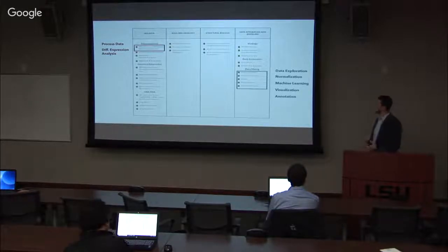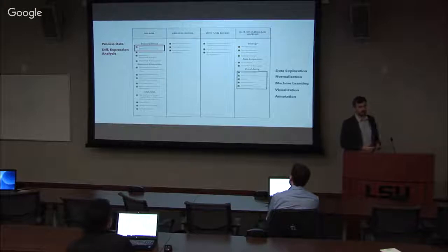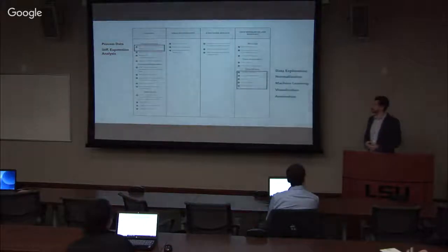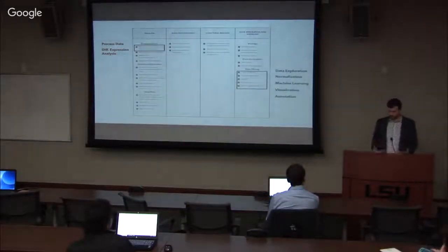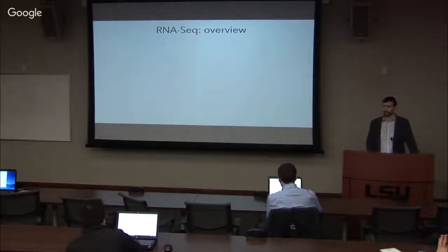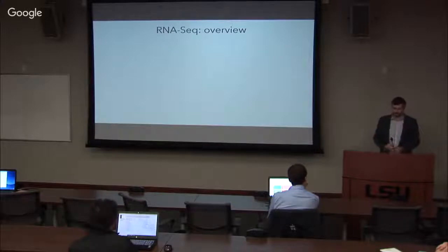So today we want to go a little bit more in depth. And the sections that we will be using is the section there on top that will give us processing data and differential gene expression as a single interface. And then over here, you can see the supervised, unsupervised analysis, and then visualization and annotation. We'll go through these things a little bit more in detail. But before we do that, just a little bit of an overview of what we did last time.